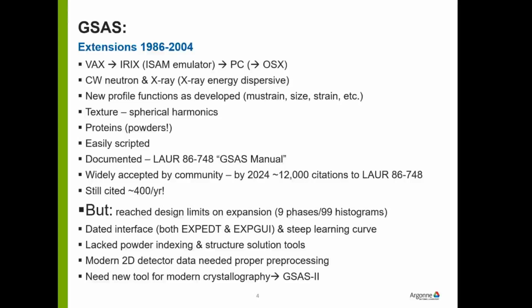So all of this stuff required code. This thing was easily scripted because all you had to do is script the menu stuff, tell it to execute something, write some more script, interfacing with EXPEDT, and you could write things to process sequential data sets.